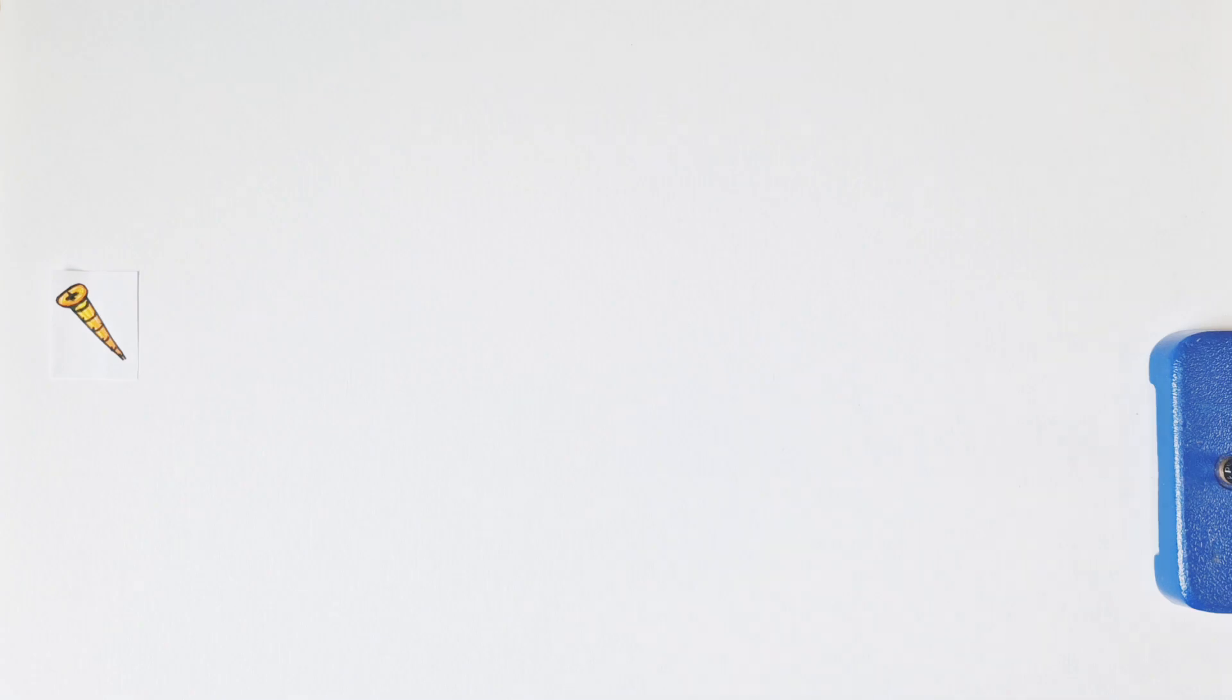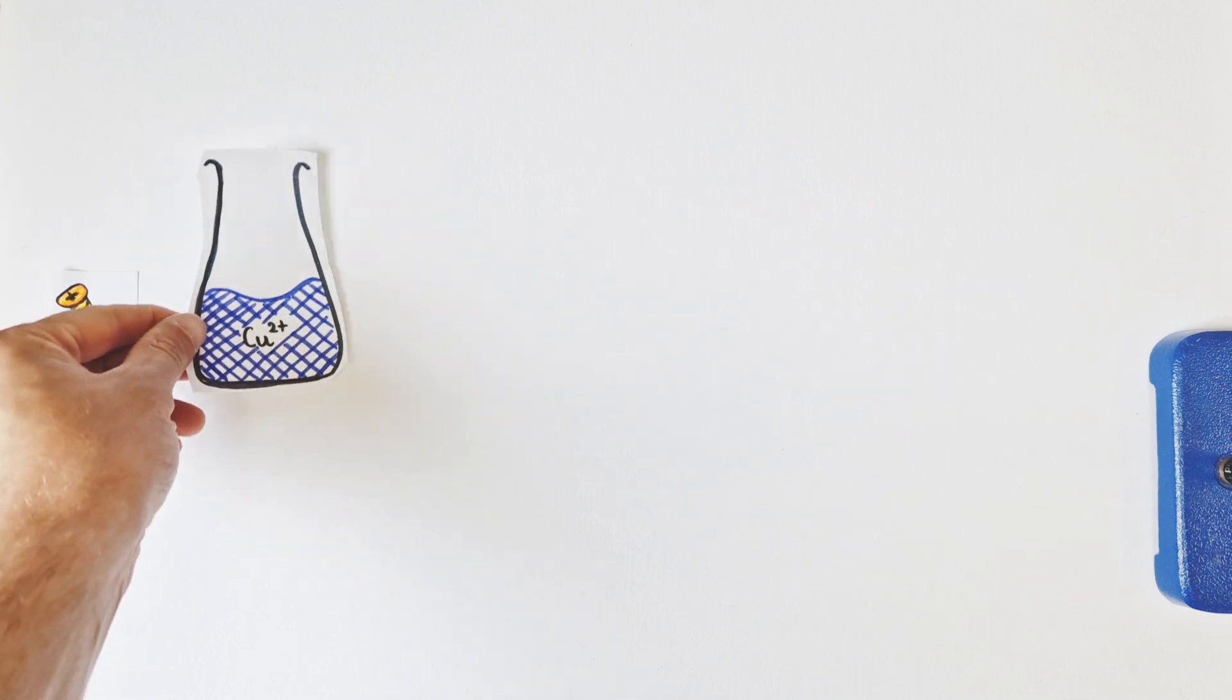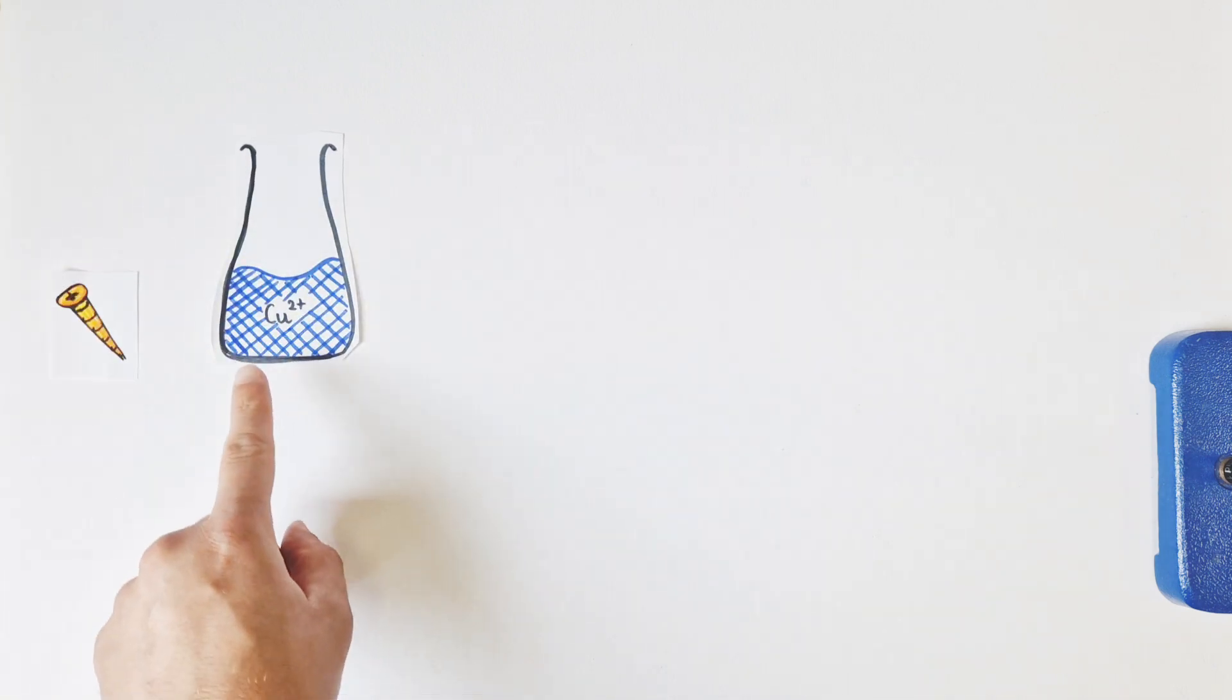Our first objective was to remove the copper from this brass nail. The best way to do this, because brass is an alloy of copper and zinc, is to react this brass nail with concentrated nitric acid. This will produce a solution of copper 2+ ions, which will be beautiful and blue and look like this.